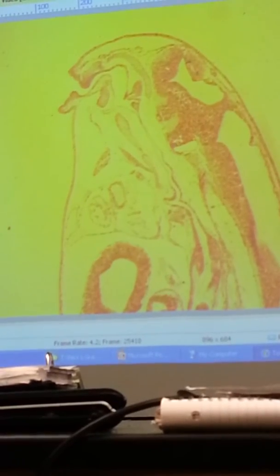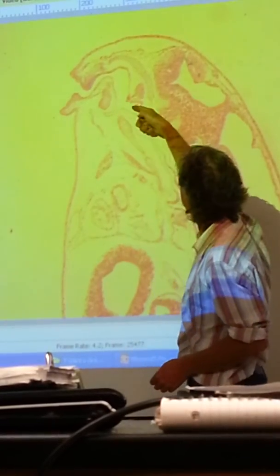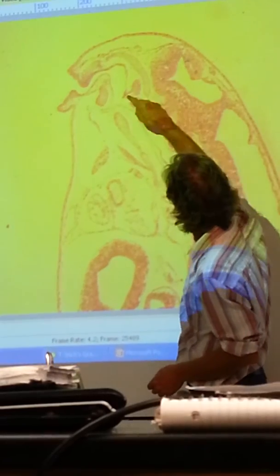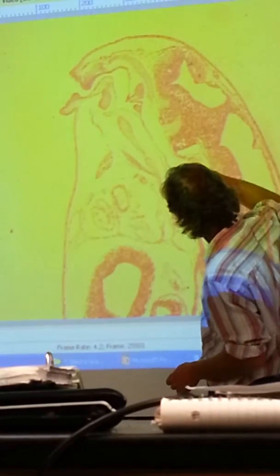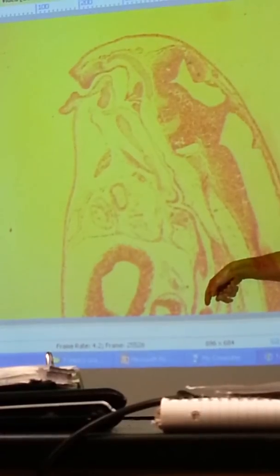Now I've moved a little closer to the middle, cutting right through the middle of this tadpole. And up here, now you can see his mouth really clearly, and through the pharynx. And then I kind of lose track of the pharynx. Maybe that's it right there. And maybe I'm coming back through the intestine as I go back.